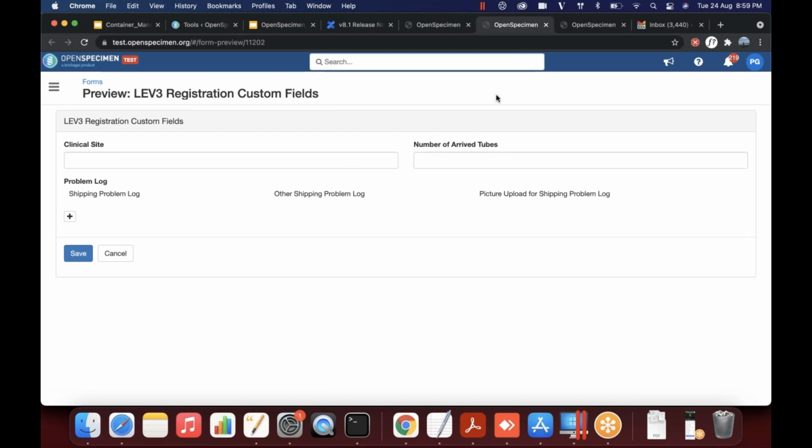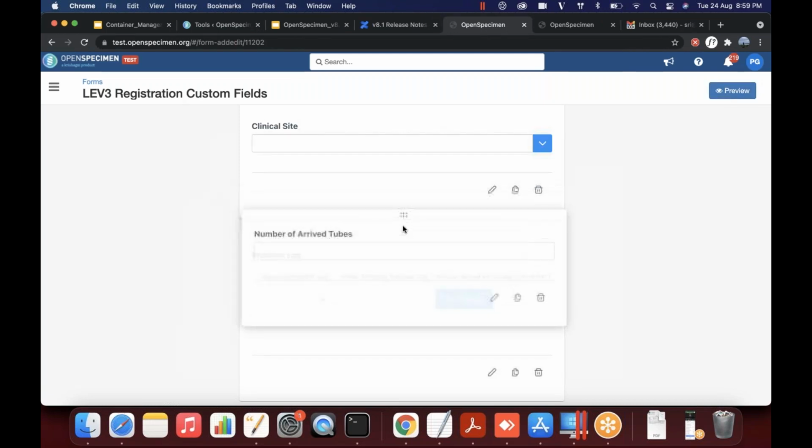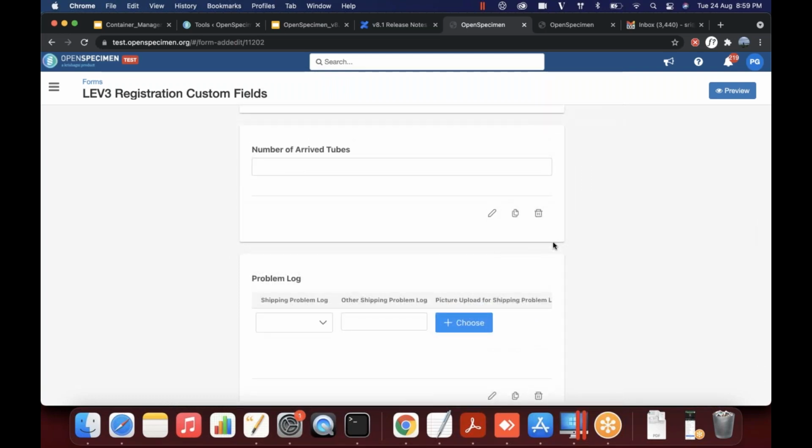So that allows you to now configure multiple fields in the same line. And before you could move the fields by dragging the fields up and down. So now you can rearrange the form, have multiple fields in the same line, etc., using this option.